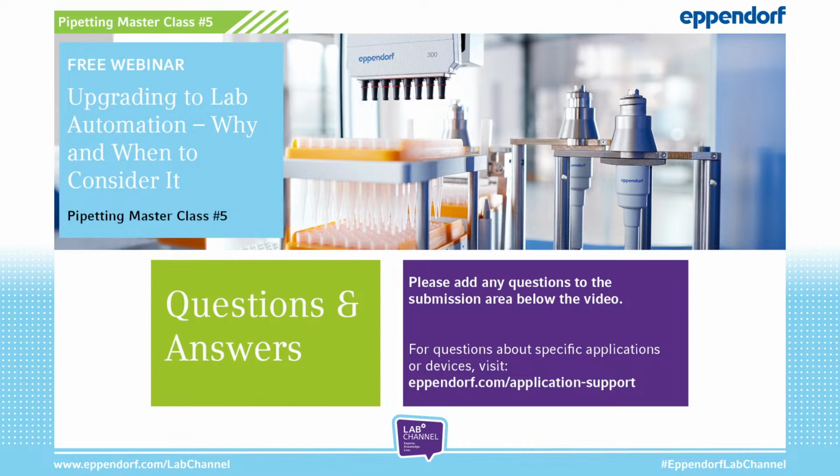In terms of the actual pipetting tool on the automation platform, it is important that you get it calibrated and serviced so that you know that you're basically getting accurate liquid transfers. Because usually the tools, whatever pipetting head you might be using, are calibrated before they come to you, so they are accurate. And in terms of the software, you program like usual and type in the volumes that you want to transfer, so you shouldn't see any issues on the software side.